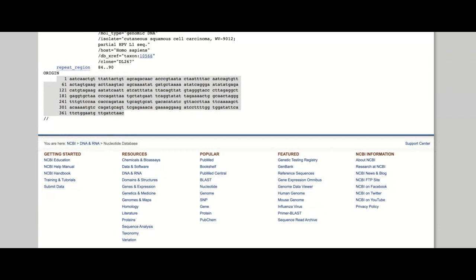So I'm going to open 2 tabs. And actually, you guys tell me, what do I use for comparing that sequence against the other 2? And I'm looking for, what sequence do they have in common? What program am I going to run? Right, Clustal is a choice. I can run that one.